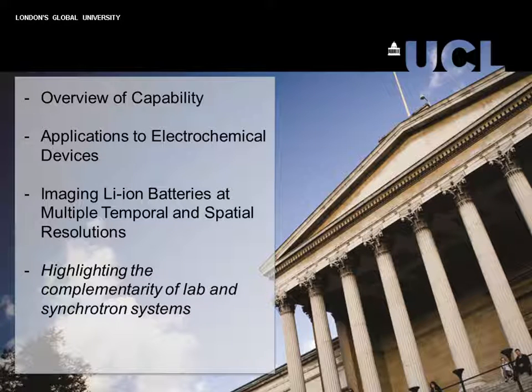I'm going to spend the majority of today's webinar looking at some case studies for imaging lithium-ion batteries across multiple temporal and spatial resolutions, and hopefully we'll see why that's so important for these lithium batteries that we've all become so reliant on in recent years. And I'm going to aim to highlight the complementarity of the lab systems as well as synchrotron systems that we still use, and perhaps pose some challenges for the microscopy community to think about how we can continue to bridge these time and length scales in an even more integrated fashion to tackle some challenges in energy materials.